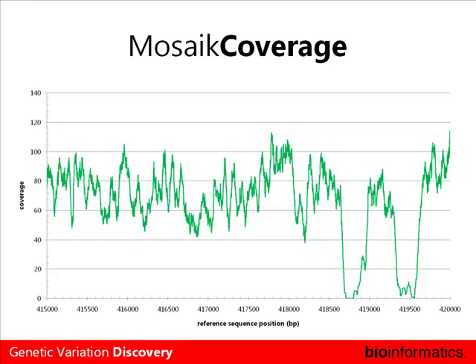Well, I think that might be what the people behind Mac tried to do. They aligned randomly, and that way, if you can't figure out exactly where something goes, maybe if you place it randomly, it will normalize the coverage.